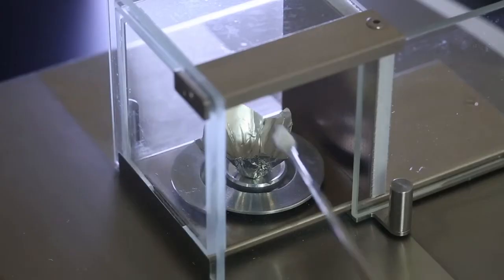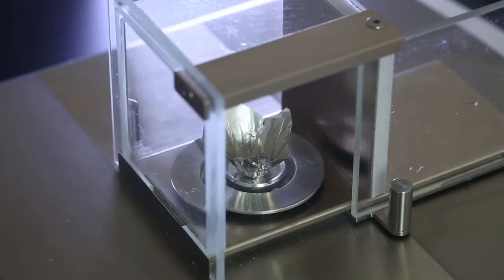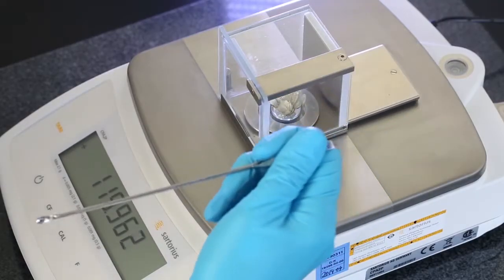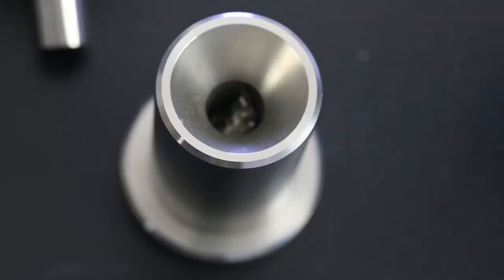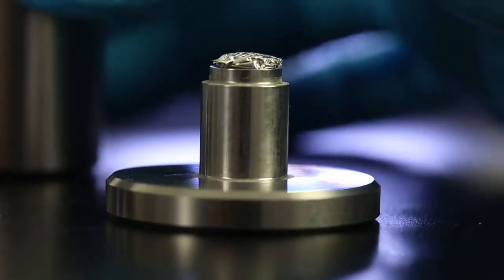Using helium technology and total gas analysis, even the smallest amounts of nitrogen can be precisely determined. Samples of up to one gram can be easily processed.